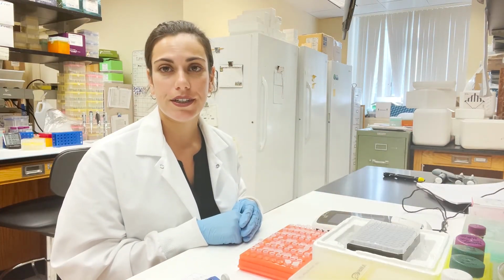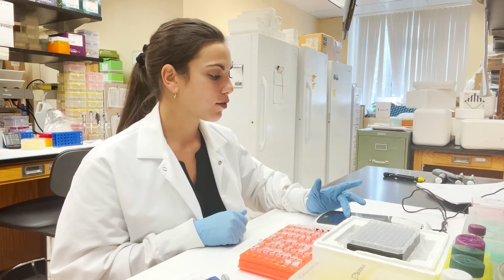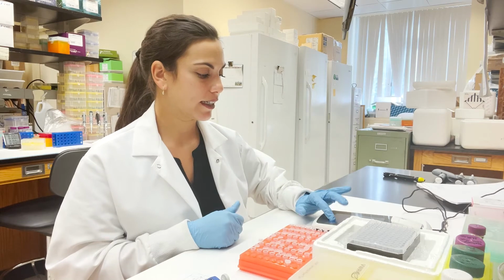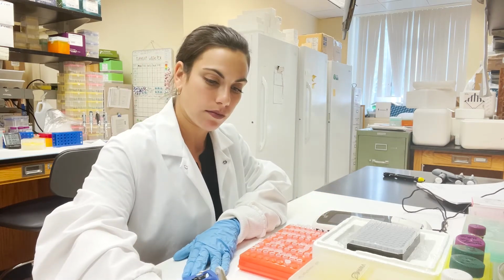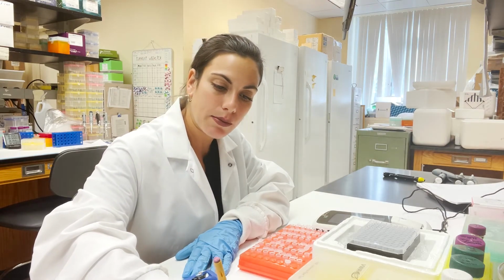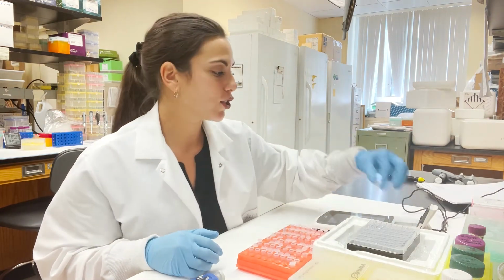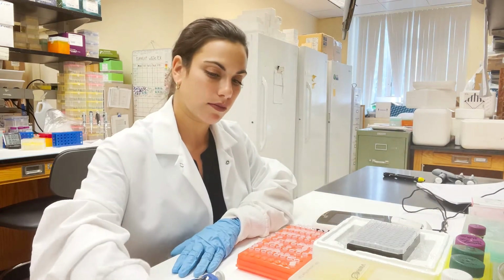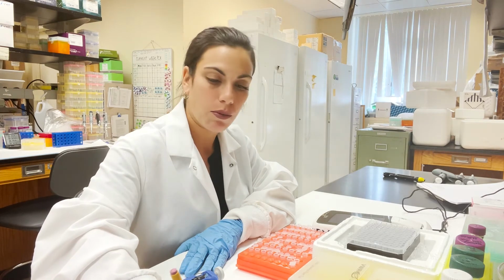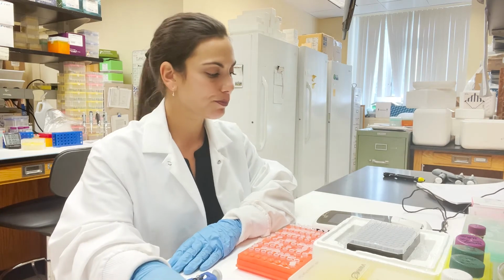So now to read the concentration of the standards, we click double-stranded DNA high sensitivity, read standards, we insert standard 1, click read standard. I like to record what I see just in case there's something wrong. And we have 26.91, which is fine. And then we do the same for standard 2, which is 12059.94. These values are normal for us, but if you have a different device, it might read differently.